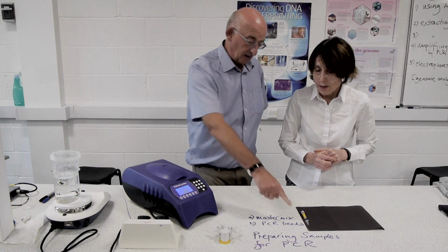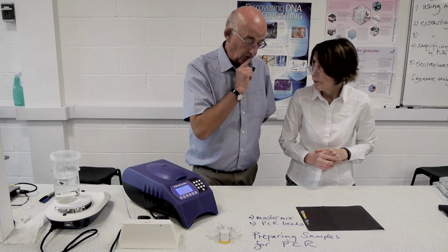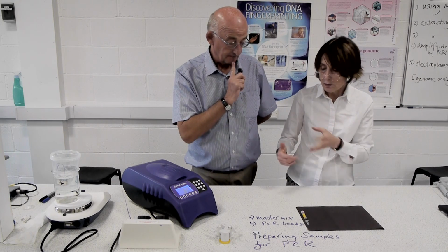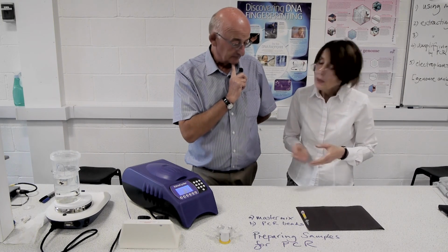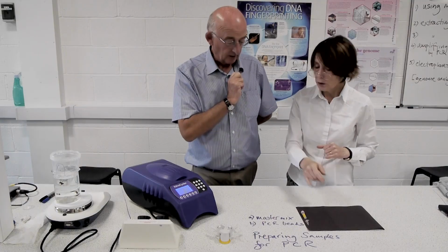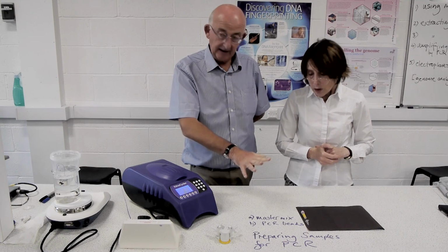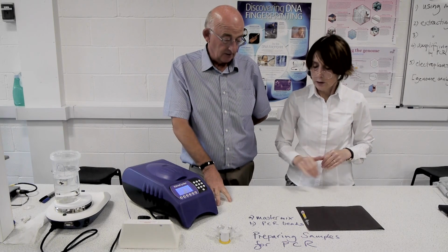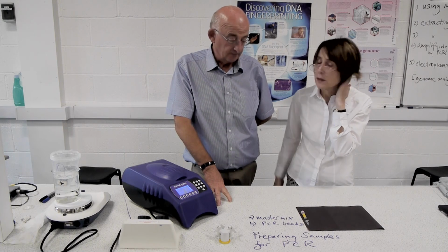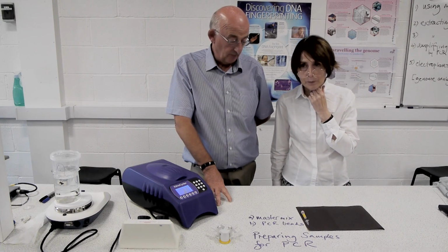How about the water? Not tap water, obviously. We'll talk shortly about primers. Primers already come in a liquid, and you basically add the primers, and you may need to add a very small amount of sterile water to your beads. But we'll come to that later on. We're going to be using master mix in our process here today. Right, thank you. We're moving on in a moment.